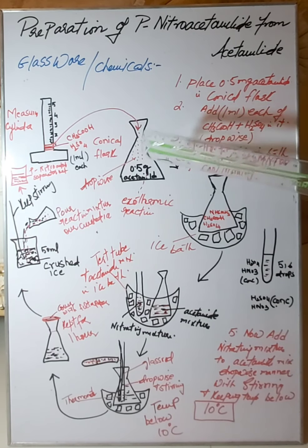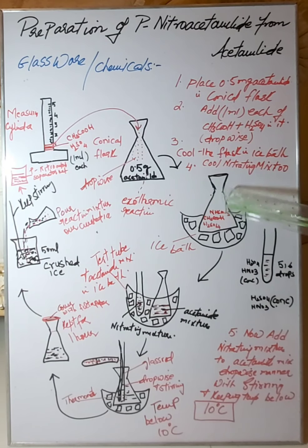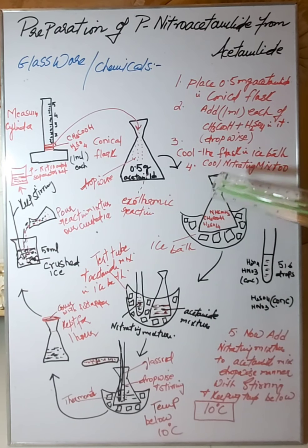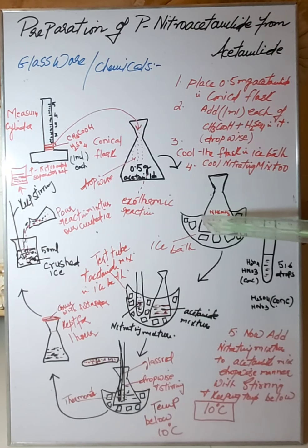Now cool the flask in an ice bath. Now you are going to put this into an ice bath. An ice bath is simply a container that contains cubes of ice, and you can put some water into it and it becomes an ice bath, right? So you will keep this mixture inside an ice bath. Now the question arises, what is the reason why we are keeping it in an ice bath? Because maybe it gives us some sort of an exothermic reaction, or the flask becomes a little bit warm, so we do not need that. We do not need the temperature to rise, so we will keep this mixture inside this ice bath, right?